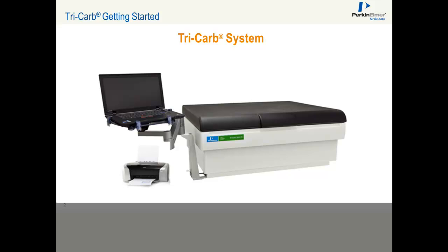The Tricarb instruments are completely computer-controlled benchtop liquid scintillation analyzers. The external Lenovo laptop running on a Windows 7 operating system controls all functions of the instrument, including programming of counting parameters, movement of samples in cassettes on the sample changer deck, counting samples, and displaying and printing sample information.